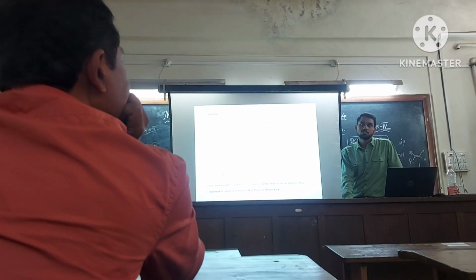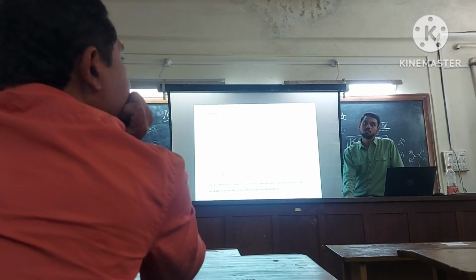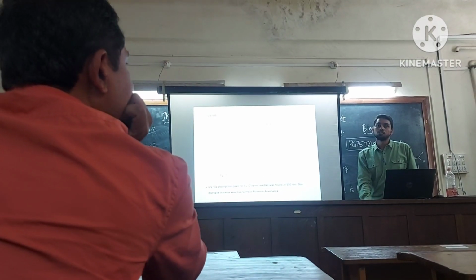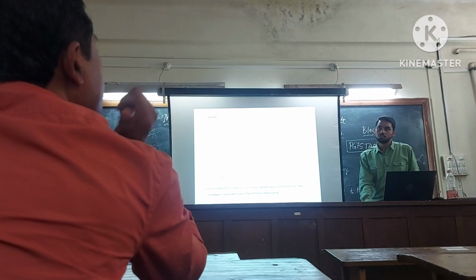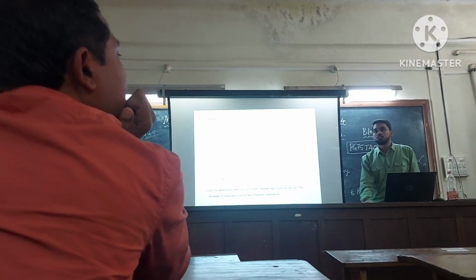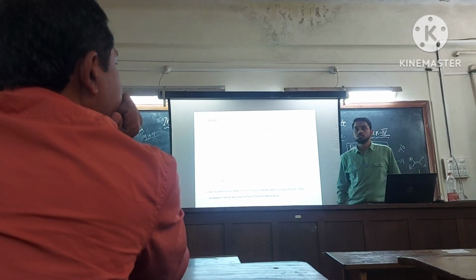The transitions which we say, on that basis the shifting is explained, not including the nanoparticles. Now this is nanoparticles we are doing, and there is nothing to discuss about the copper oxides in UV.